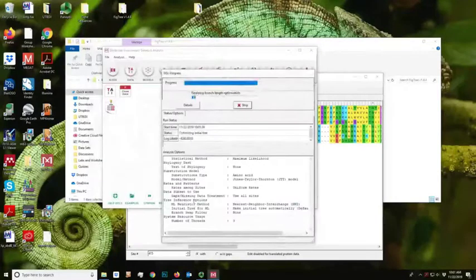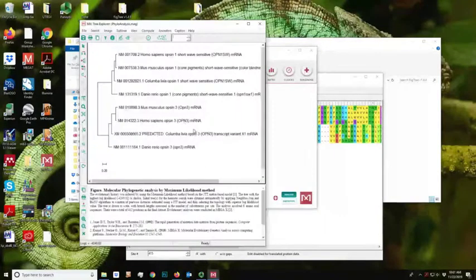And we've done this all before in previous exercises. So here we have our gene phylogeny now. Again, that's just a very quick version. You may want to do more analyses and double check them and see if they are congruent. But here we've got this. All I want to do is save this.